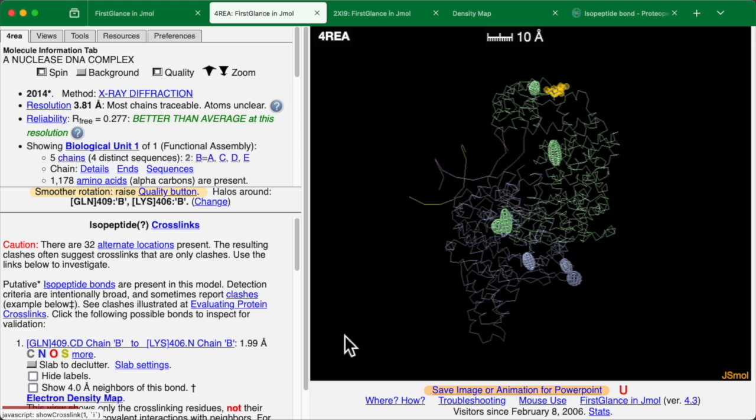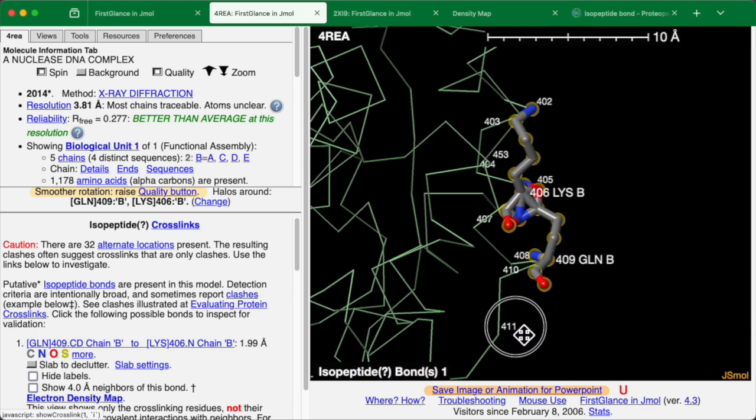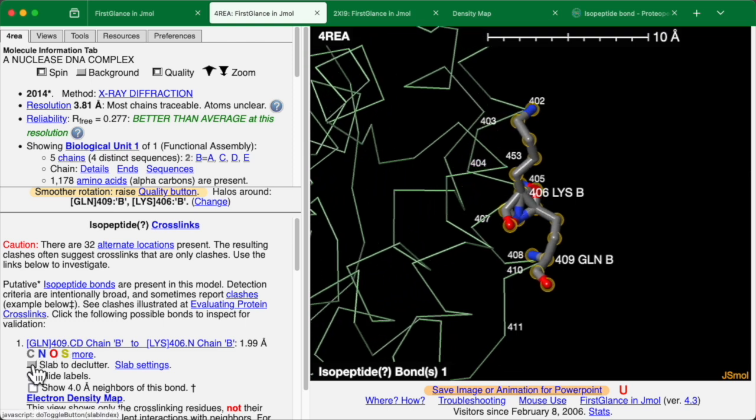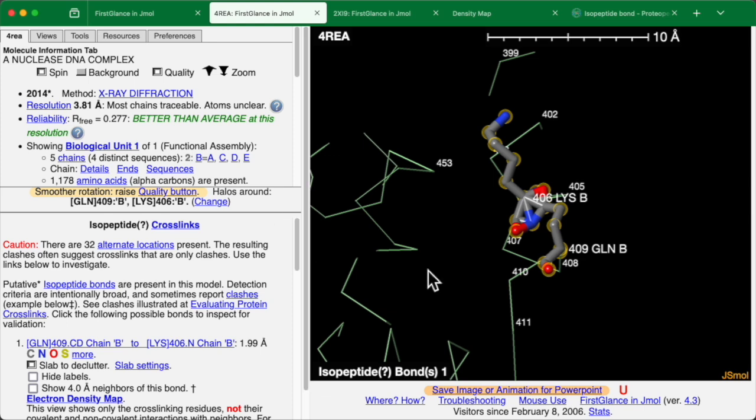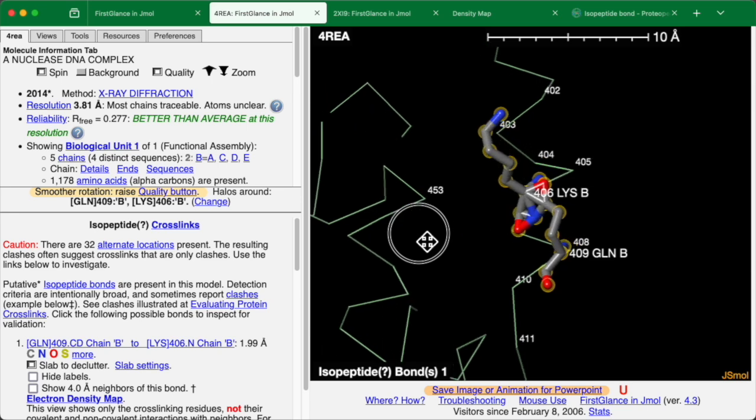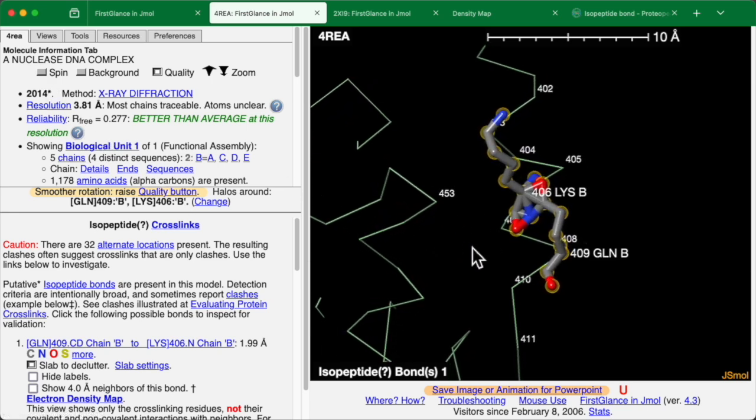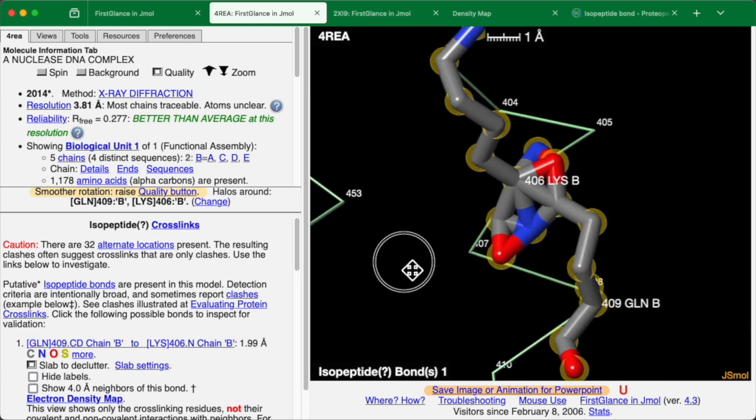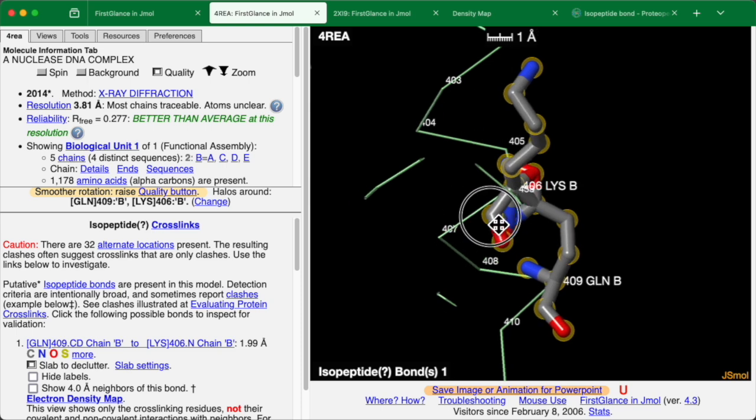We'll click on it here. We get the little movie that shows us where it is, zooms in. And let's look at it. And this time I'll click slab here to help right away. You notice right away, if you're familiar with these atomic stick representations, that this doesn't look right. There's a kind of... I'll zoom in a little bit here. I'm using my mouse wheel to do that.